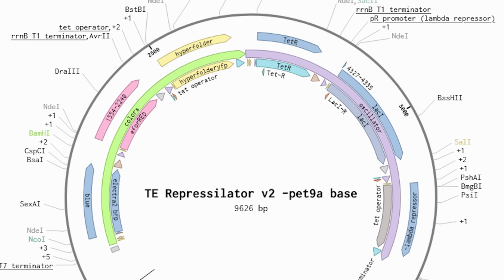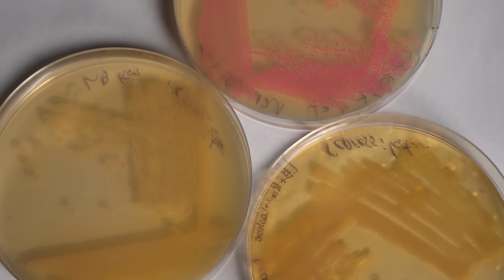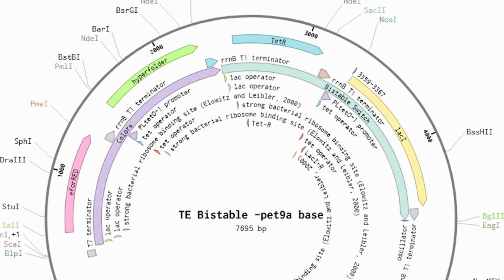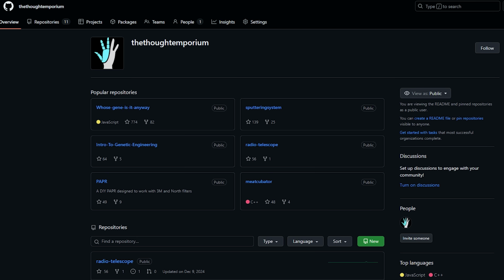Also, this and all the rest of the constructs are designed to be easy to pop pieces out and replace them. Don't like one of the colors? No problem, it pops right out. Or you could apply this to something totally new and replace the colors with enzymes. The plasmids are all open source and you can change and use them however you want, and all the code is available on our GitHub.